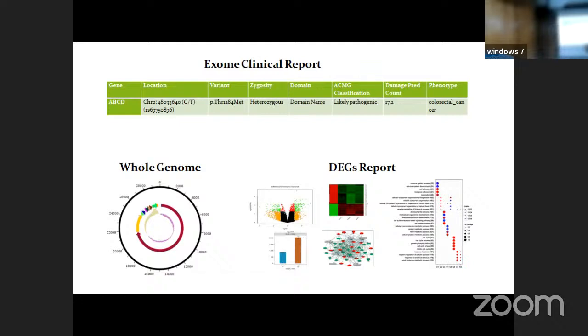Okay, and it is being done at the Genomic Center. Let me tell you, for the pipeline we have developed at the Genomic Center, you need not do anything. You just need to give the exome samples, and it will generate a report, something like this. It is being done, and we always welcome you if you want to utilize the facility of the Genomic Center.